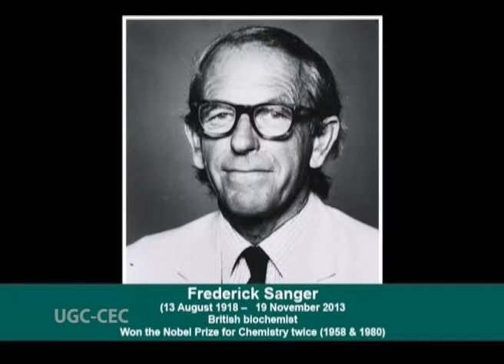The Sanger dideoxy method or chain terminator method, developed by Frederick Sanger and co-workers, awarded the 1980 Nobel Prize in Chemistry, has been dominant in the field. The method relies on replicating many copies of the to-be sequenced DNA segment in 4 separate in vitro reactions, where each reaction is associated with one of the 4 dideoxynucleotides.